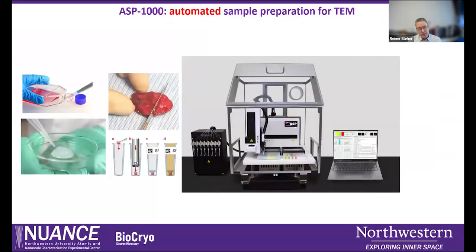So the next step, once the plates are prepared, is to load the samples, to mount the samples into the capsules. We can basically use any sample that does not disintegrate during the process. So we can use tissue pieces, hydrogel pieces, or pieces of anything that can be cut into small enough cubes that we can place in the capsule.